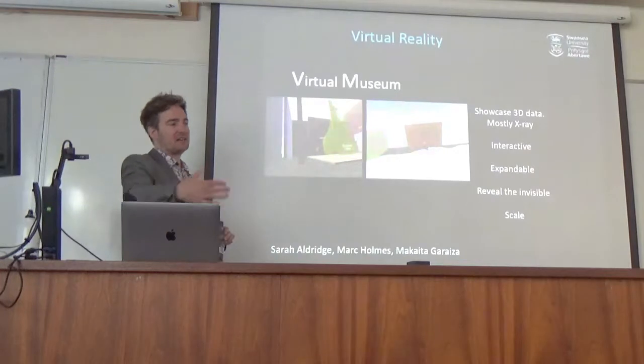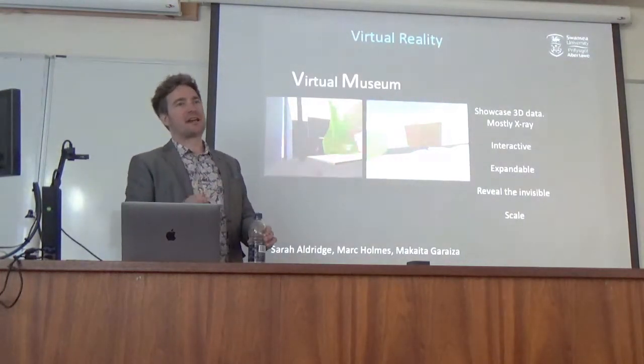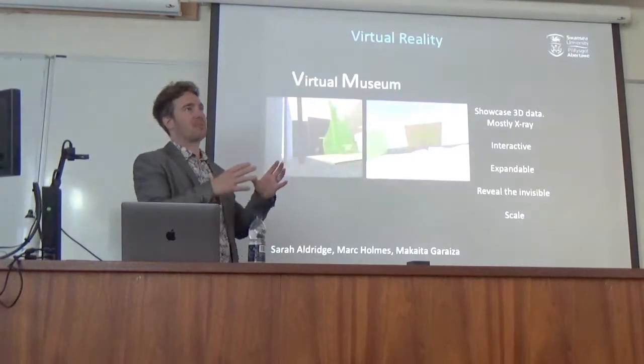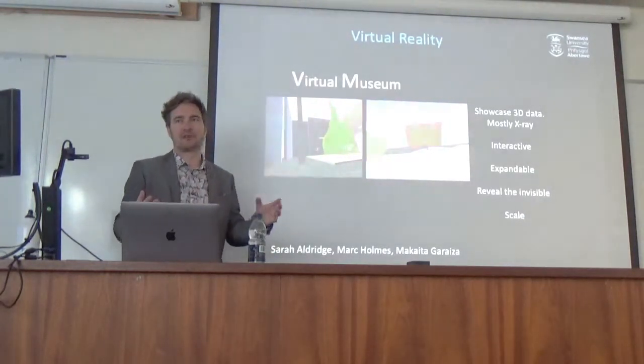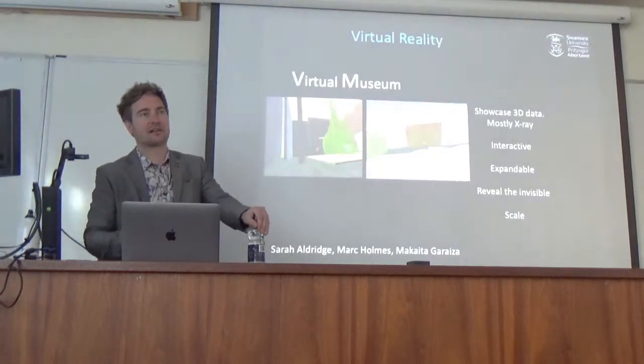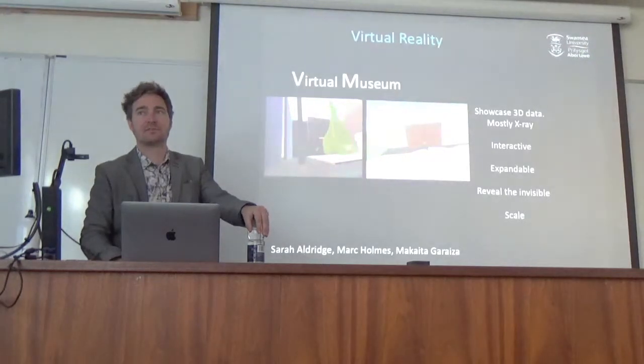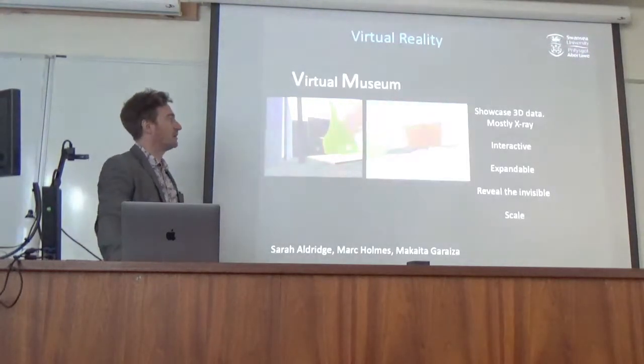This kind of sits at the end of our workflow, so we do everything, and then for this virtual museum, we have to go back into our data and create a specific output, because we have to simplify the volumetric data. It needs to be just surface data for the VR to be able to handle it, and reduce the number of faces to quite a low number for it to be able to be held within VR.